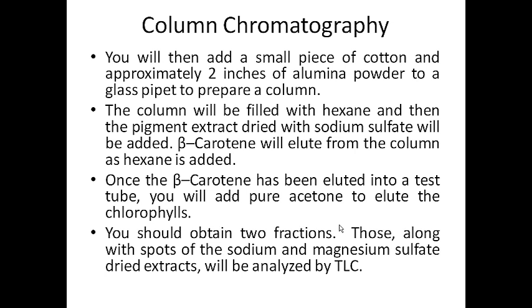It'd be interesting to see where the xanthophylls show up in all of this, or maybe they actually were collected in one of the clear fractions that we aren't going to analyze. Okay, so that's what we're going to do in this experiment. Prepare the extract and then do TLC and this column chromatography to then separate the pigments out.